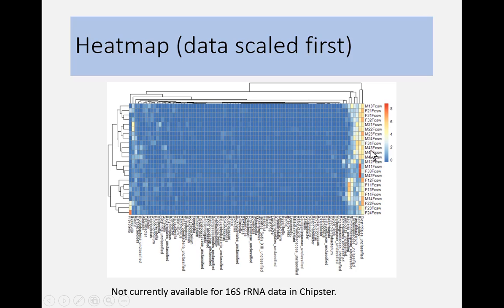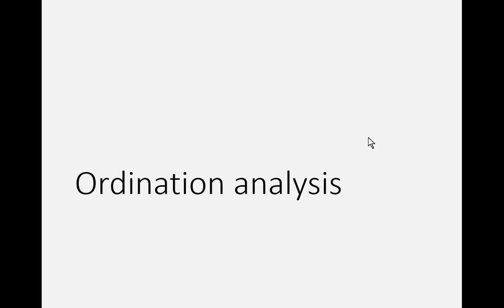One way which is nice to show here is that you can actually cluster the samples first using k-means before you draw the heat map. It kind of makes the dataset smaller and allows you to see different kinds of things from the heat map too. But we might add this in Chipster too. Okay, so those are the visual tools.